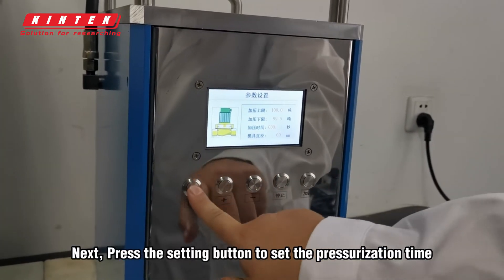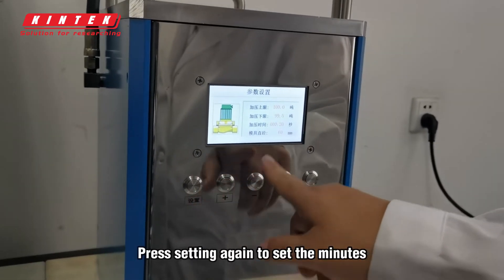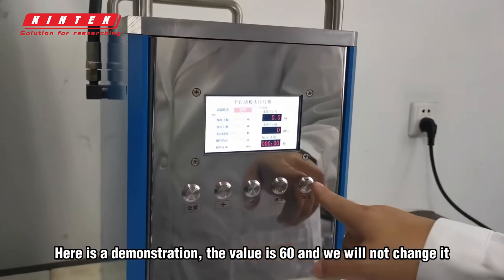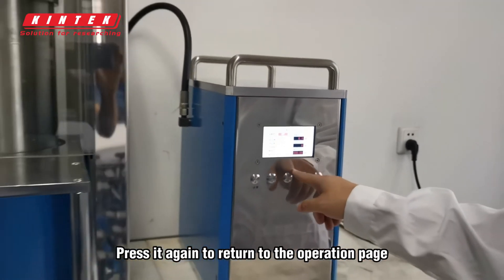Press the setting button to set the pressurization time. Here we set it to 20 seconds. Press setting again to set the minutes. The maximum can be set to 999 minutes. Here is a demonstration — the value is 60 and we will not change it. Press it again to return to the operation page.